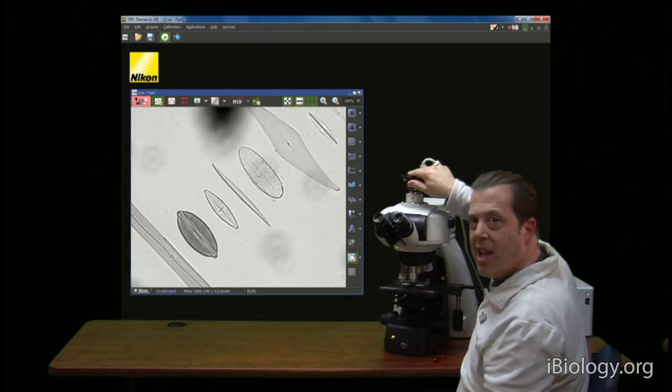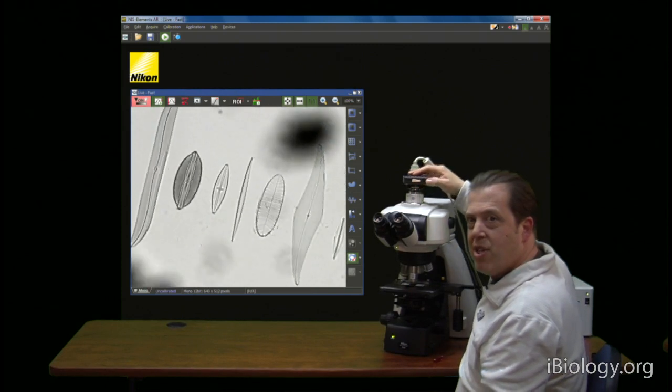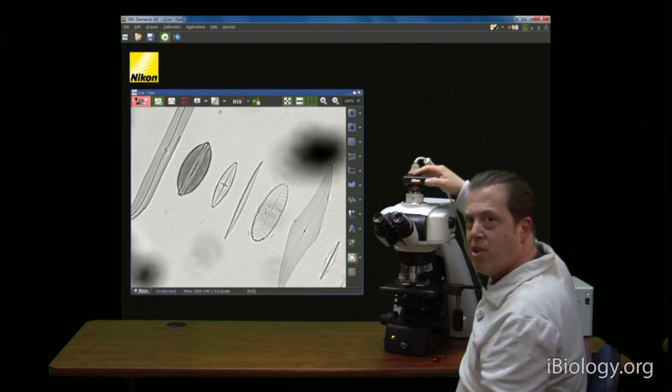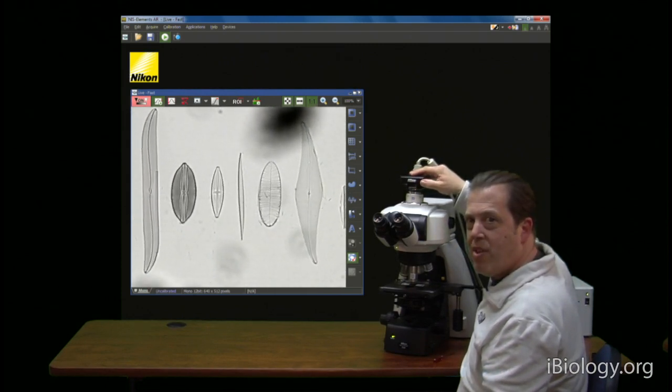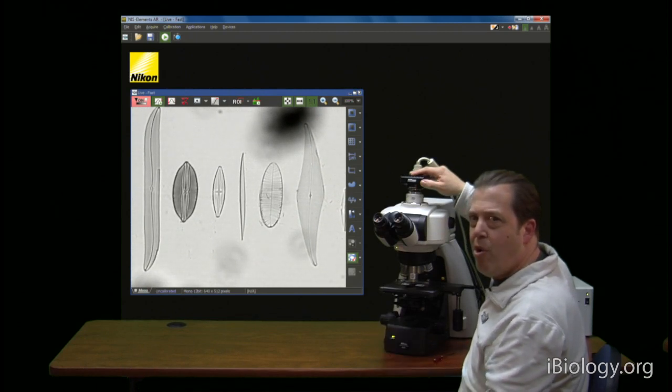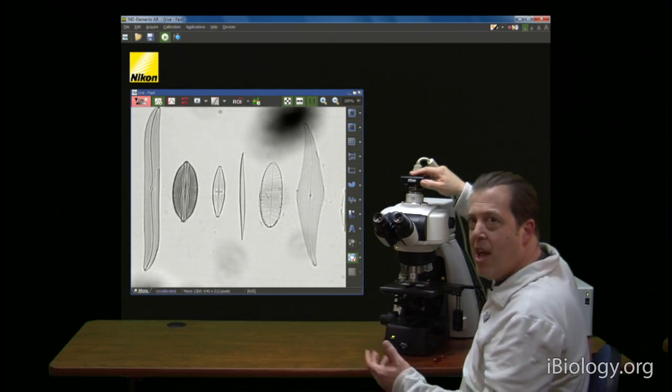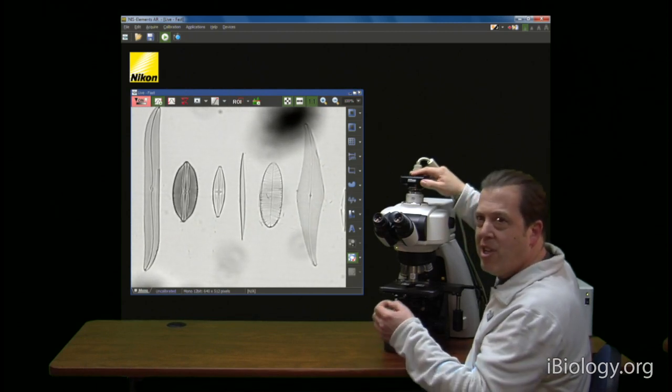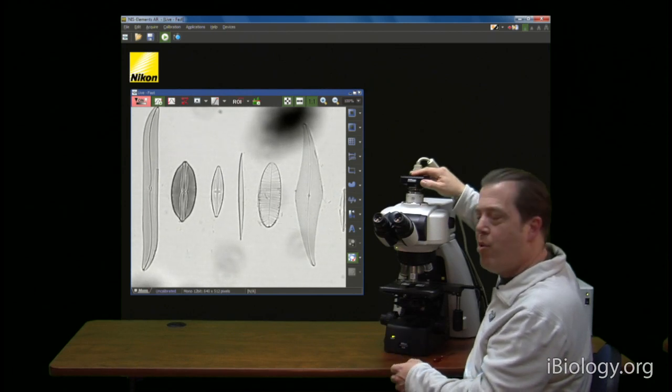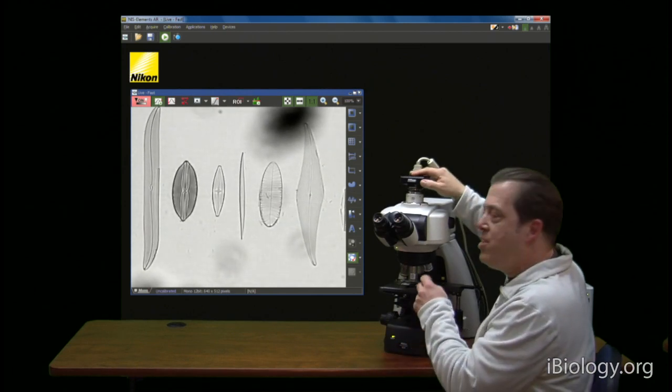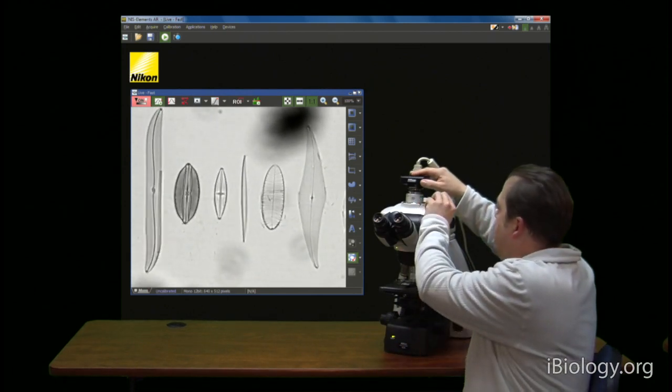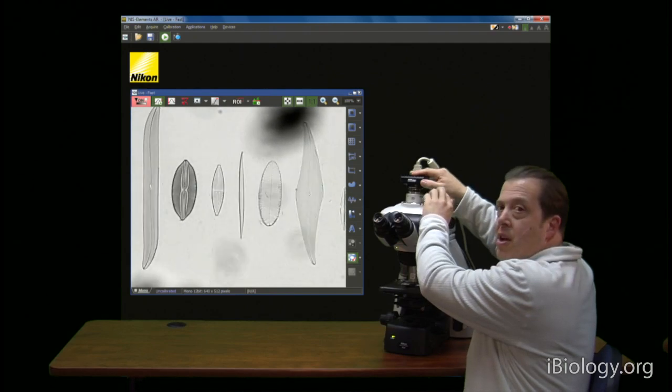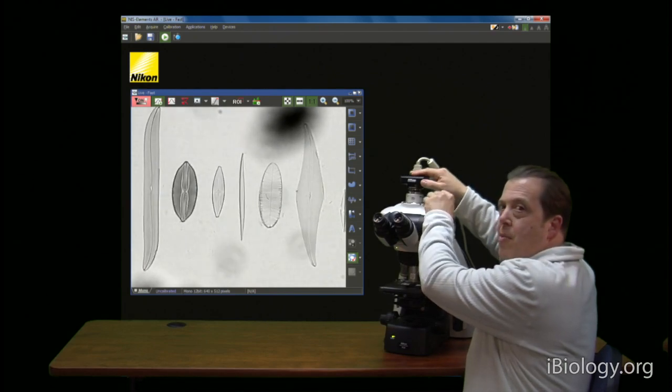And rotating the camera now, you see that most of the dirt that's left is rotating with the camera. But there's some very small light residual dirt that we would actually have to go and clean the window of the camera with some sort of a solvent and lens cleaner, lens paper. So let's tighten this up again.